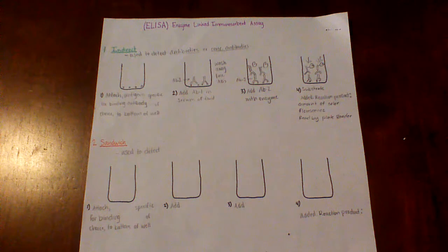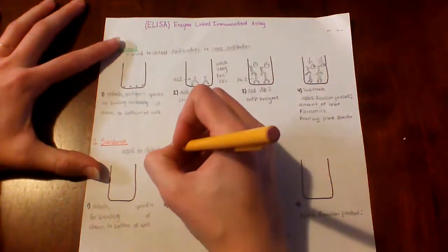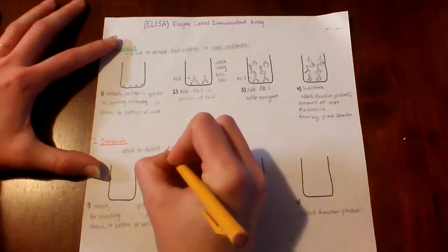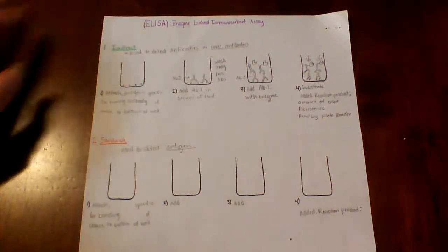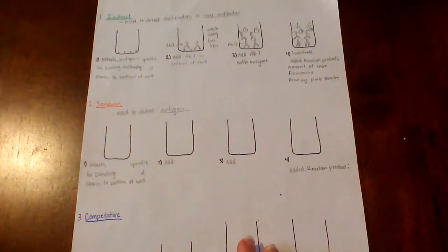Okay, so for the sandwich ELISA, the sandwich ELISA is used to detect antigen or cytokine concentration in tissue cultures, in serum, and in body fluids. So for step 1, it's going to be the opposite of the indirect ELISA method.